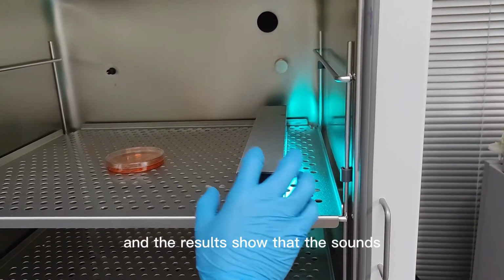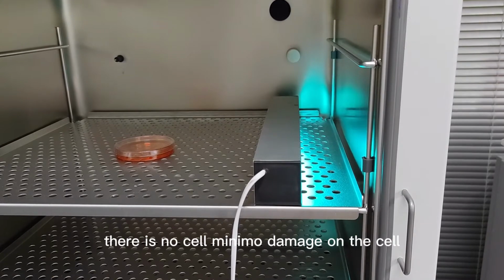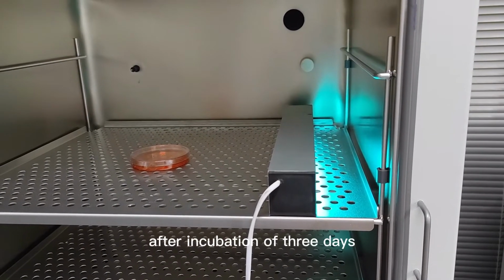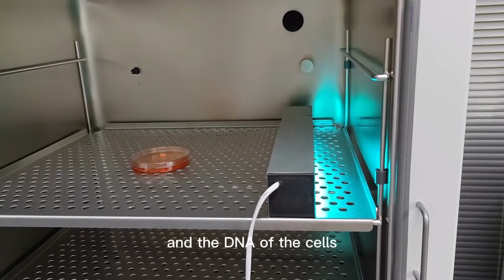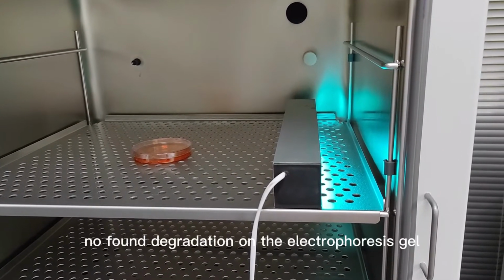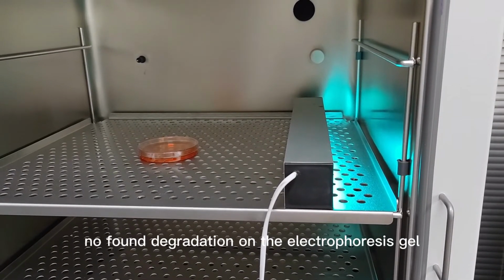The results show minimal damage to the cells. The cells still look normal after incubation of three days, and no DNA degradation was found on the electrophoresis gel.